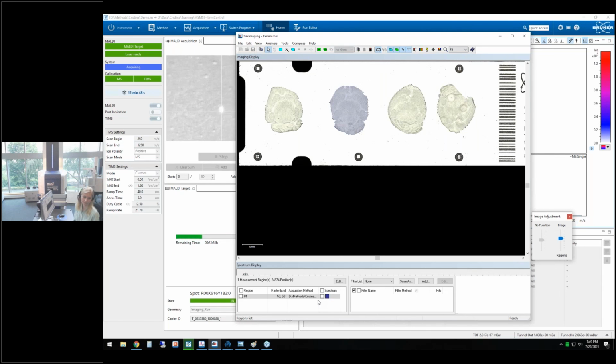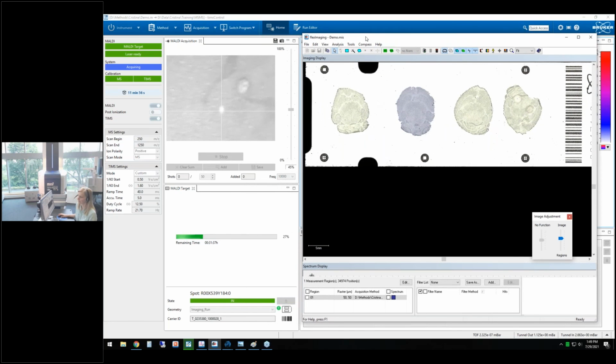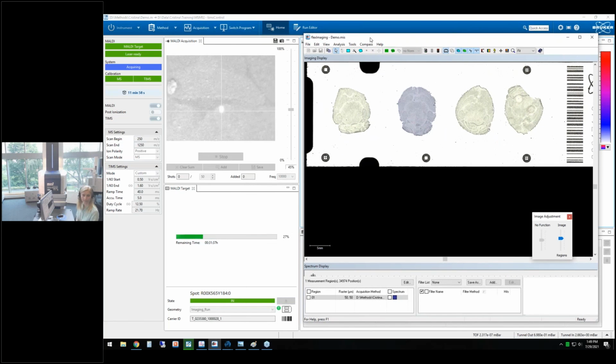Kate, back to you. How does Metaboscape utilize MSMS? So each dimension of information that you have is going to help with your annotations in Metaboscape. Since it was originally an LCMS platform software solution, the MSMS data is how it was originally helping to assign peaks along with retention time.